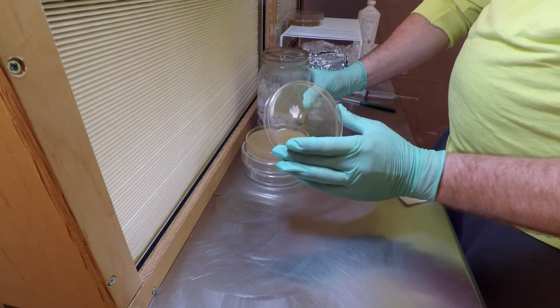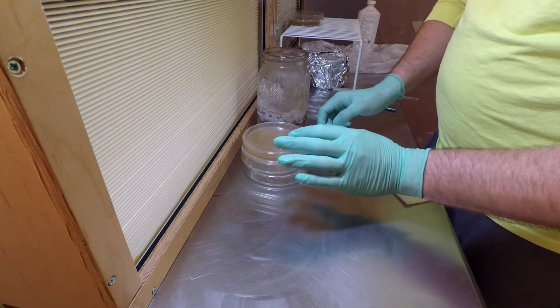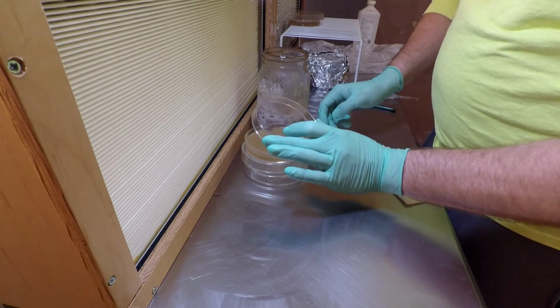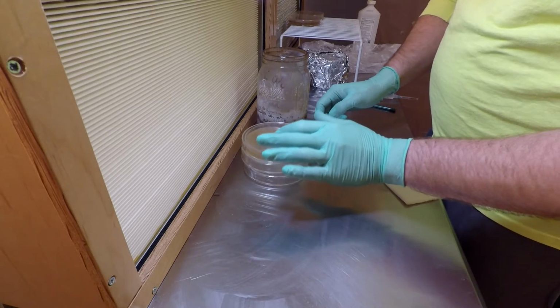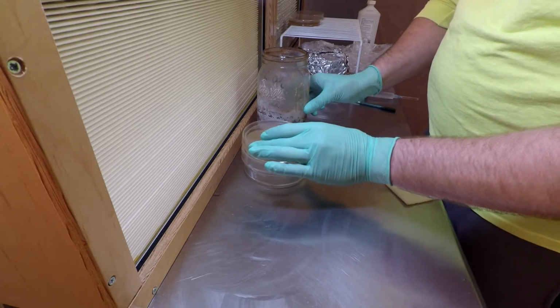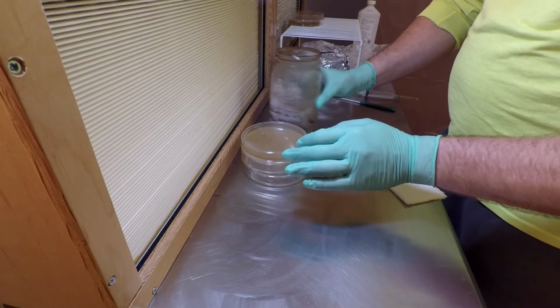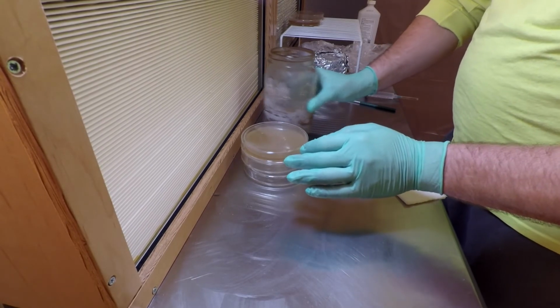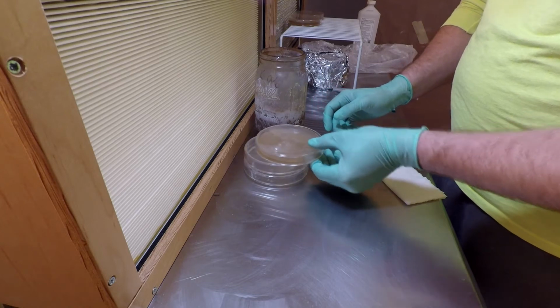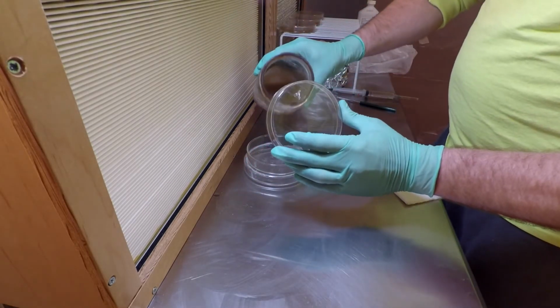Doesn't help that I poured a whole lot into that dish too. Yeah, that's a bit better. Just a light amount of steam. Probably a small amount. It's not going to be enough to cause any water droplets. Try to swirl it around, cool it off just a tiny bit. I can see it actually sticking to the inside of the jar, so can't really cool it off much more than that. Otherwise I'm going to lose some. I think that'll be good enough though.